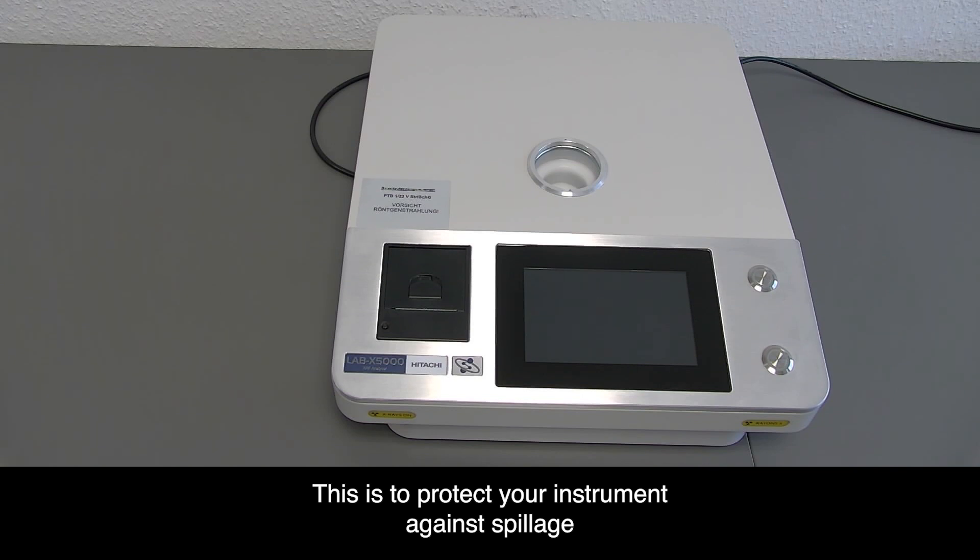This is to protect your instrument against spillage or leakage of the sample.